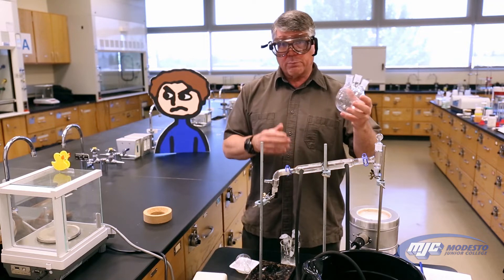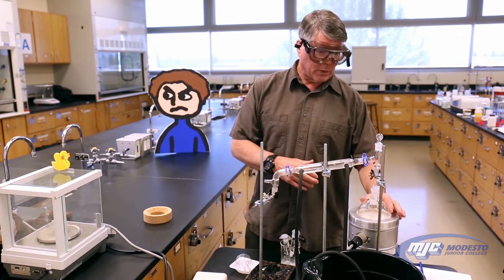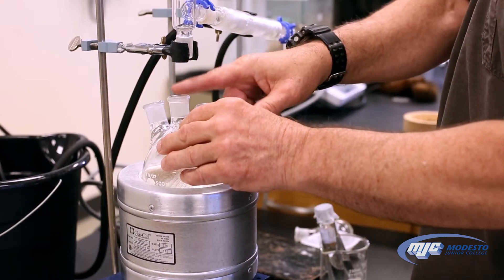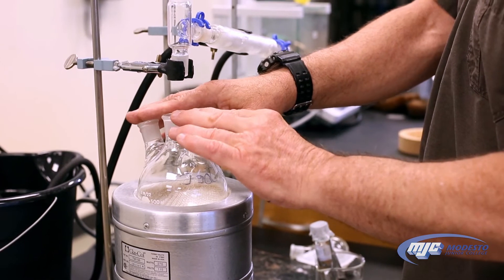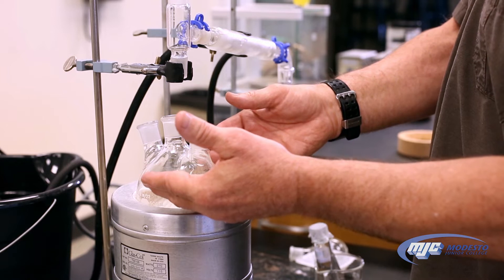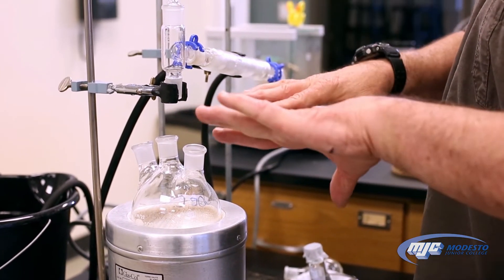Basically what's going to happen is we're going to put our solution in this flask right here and we're going to heat it up. Everything's going to be stoppered up. As this heats up, the solution in here is going to start boiling. As it does, the water evaporates, but the sodium chloride stays behind.